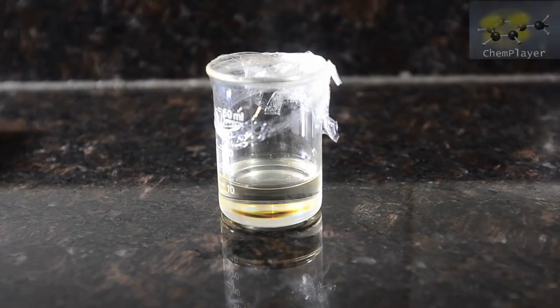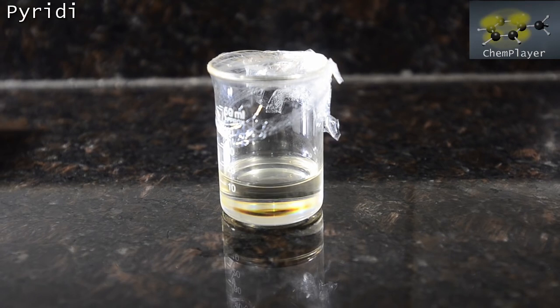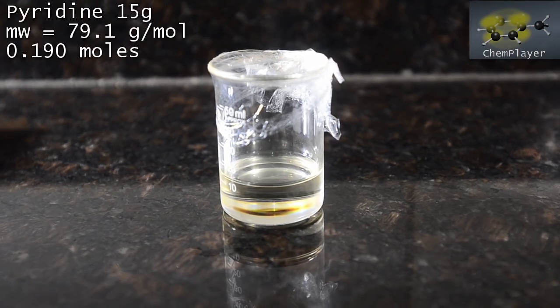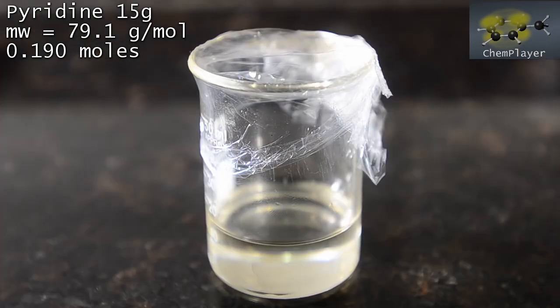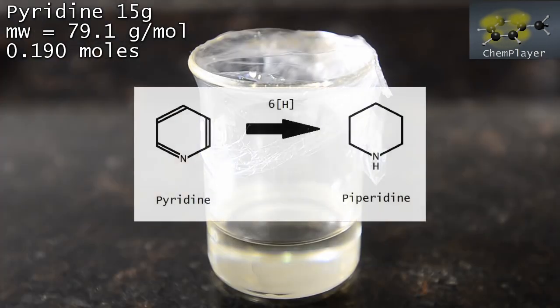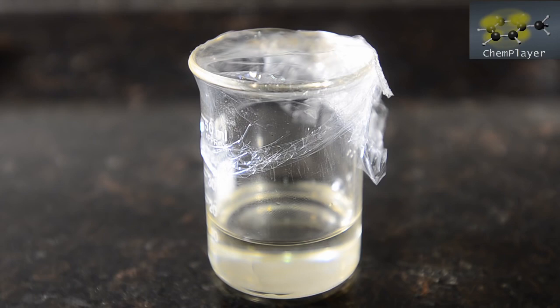Today we're going to do an experiment we've been putting off for a while. Here we've got 15 grams of dry liquid pyridine. We're going to attempt to reduce the aromatic ring of the pyridine to form piperidine. A pretty serious reduction. And it's going to call for a serious reducing agent.